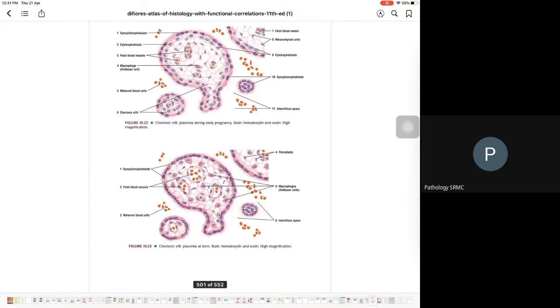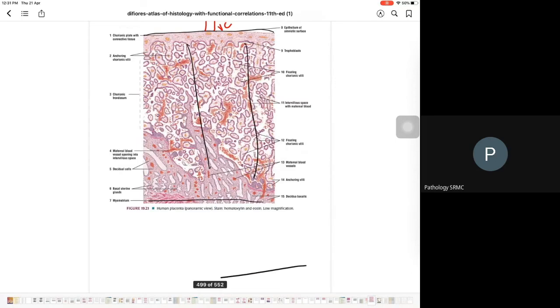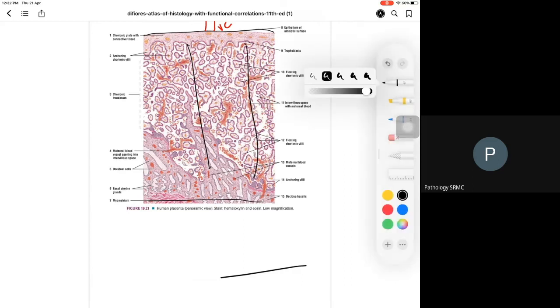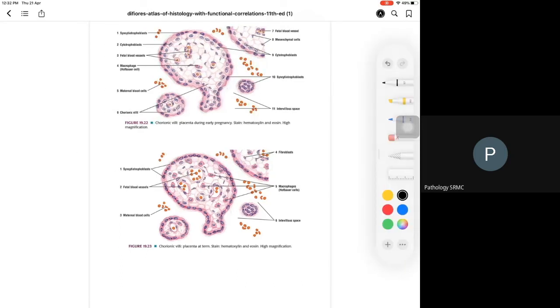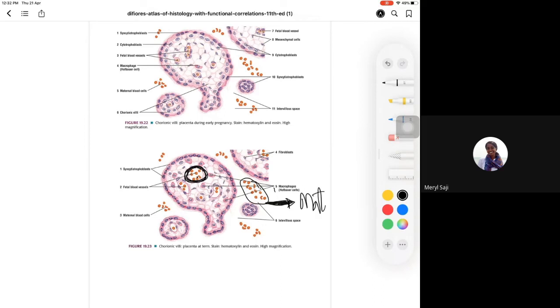This is the fetal surface, this is the maternal surface - you can see the spiral arterioles and this is the placental parenchyma. This is how the parenchyma looks, this is how the villi will look. In the previous picture, these are all villi and these are all the intervillous spaces. Whose RBCs are these and whose RBCs are those? That understanding is very important - these are maternal RBCs and these are fetal RBCs.